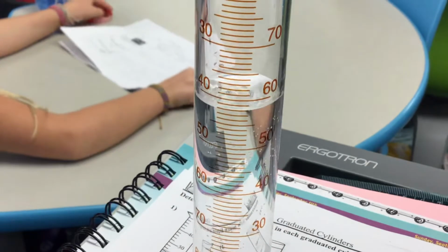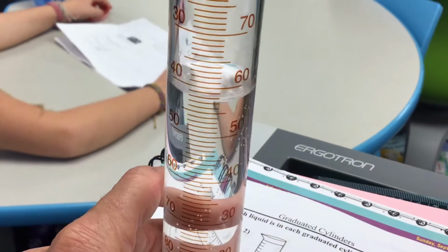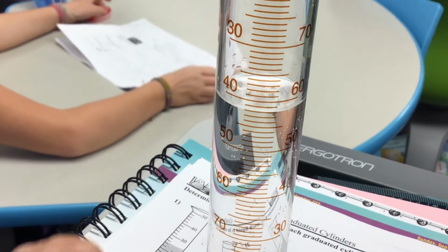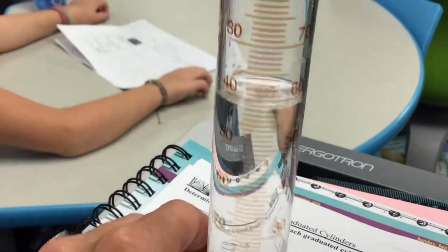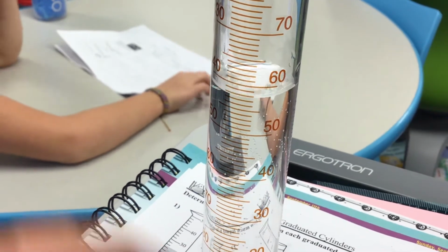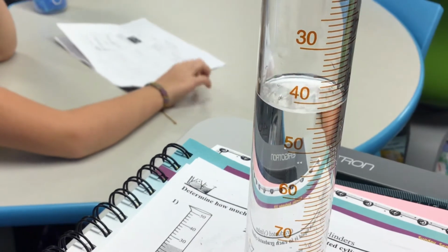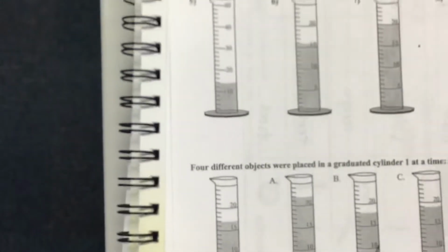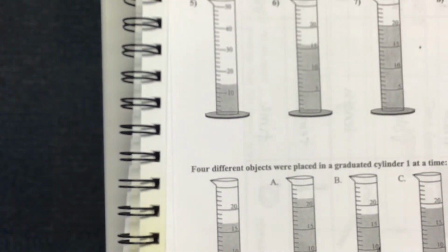So you have to pay attention. This is only on the glass graduated cylinders. But on the glass graduated cylinders, you need to use the scale that's going up. Think of it like this: if it were empty, it would be 0, not 100, right? Does that make sense? Yes. Okay, so what I'm just trying to show you there is that you have to pay attention to the scale, okay? Now, let's practice reading it. We want to make sure we can do this.